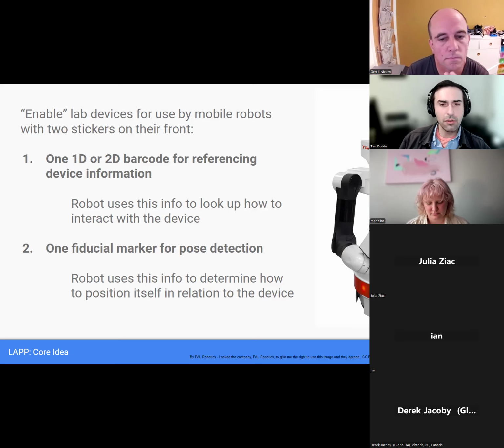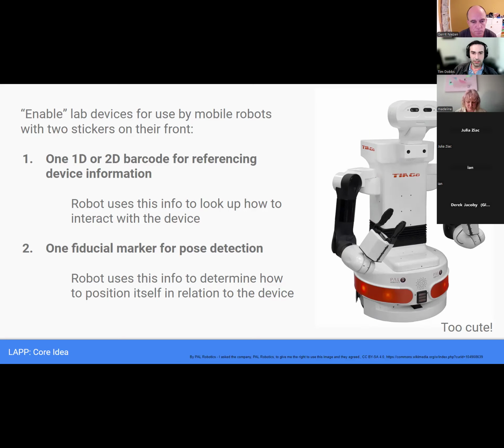So this is kind of equivalent to the MTP file in BioForm's plug and play protocol. The way they envision this is that the robot scans this, and then it is configured to talk to some database. And they mention a few database possibilities, nothing that I'd ever heard of, but worth digging into maybe if this is compelling.